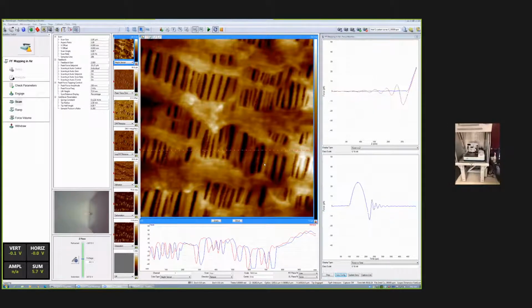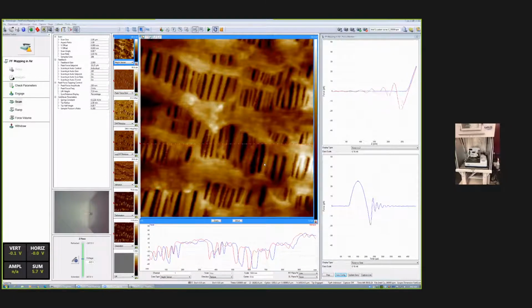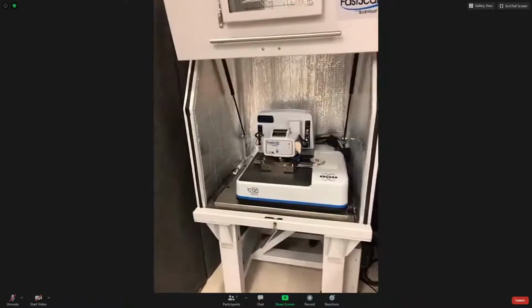So actually, can we pin my view right now really quickly just so I can show them the microscope because I'm seeing the interface. Actually, I guess that's probably because he's sharing. Can you stop the share? Yeah, stop the share. Okay.